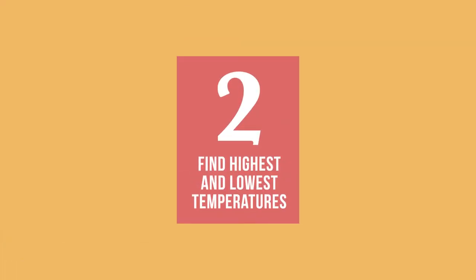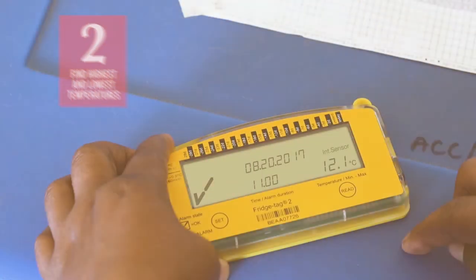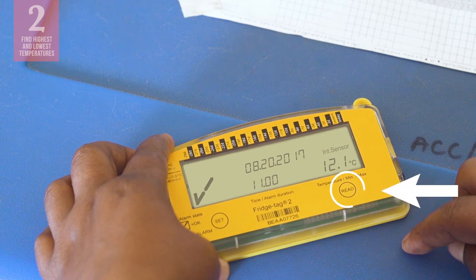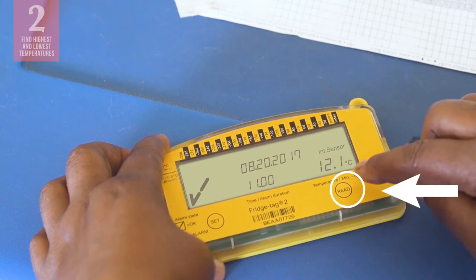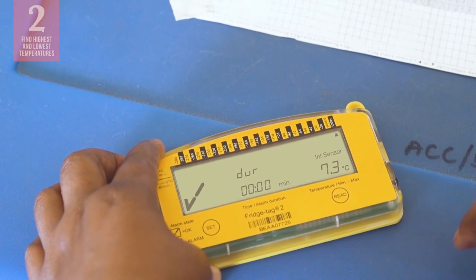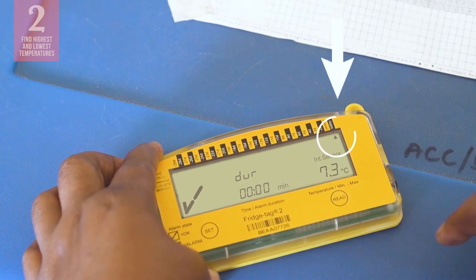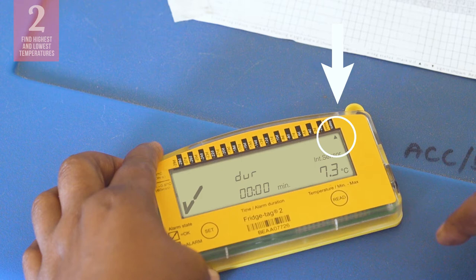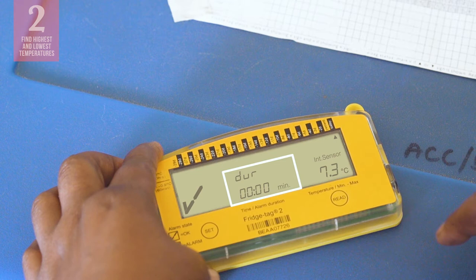The second important task is to find the highest and lowest temperatures for the day. To do that, you will use the Read button. Start by pressing the Read button once. At the top of the display, you will see a flashing up arrow appear. The flashing arrow is a sign that you are looking at the highest temperature of the day. In the center of the display, you will see the amount of time that recorded refrigerator temperatures were above 8 degrees Celsius today.